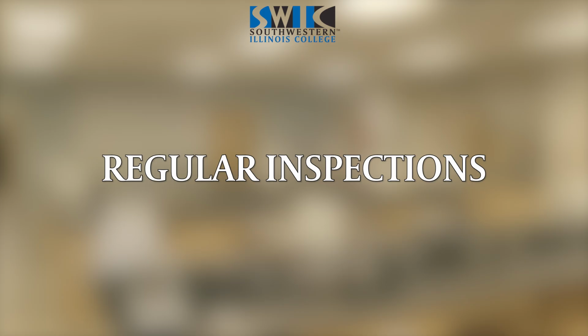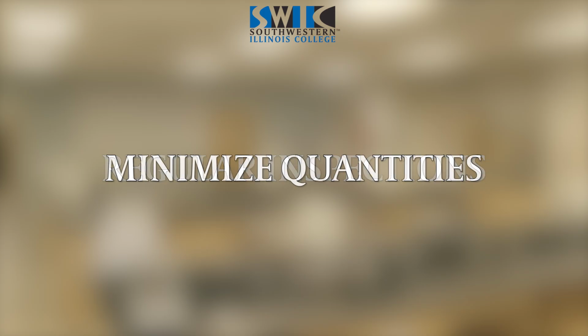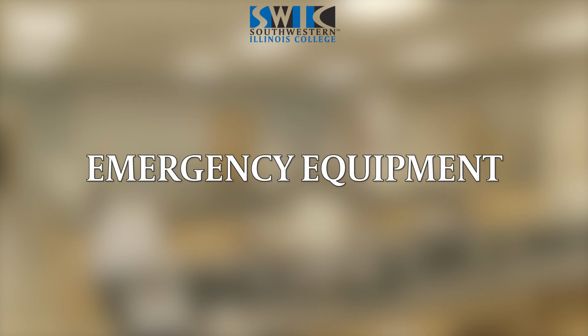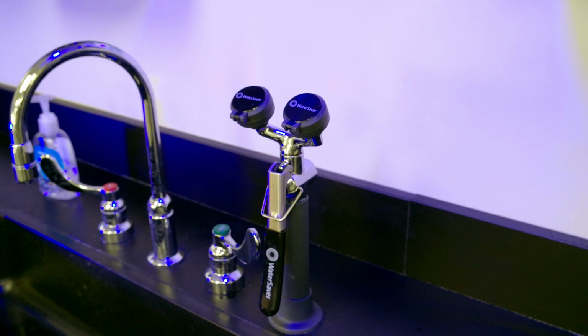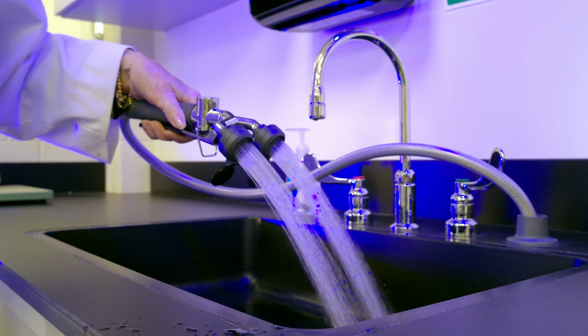Regularly inspect your chemical storage areas. Look for damaged containers, leaks, or signs of deterioration. Address issues promptly to avoid any accidents. Keep only the quantities you need. Reducing excess chemicals minimizes the risks and keeps your workspace clutter-free. Always have emergency equipment nearby, such as spill kits and eyewash stations. Being prepared for accidents is as important as preventing them.